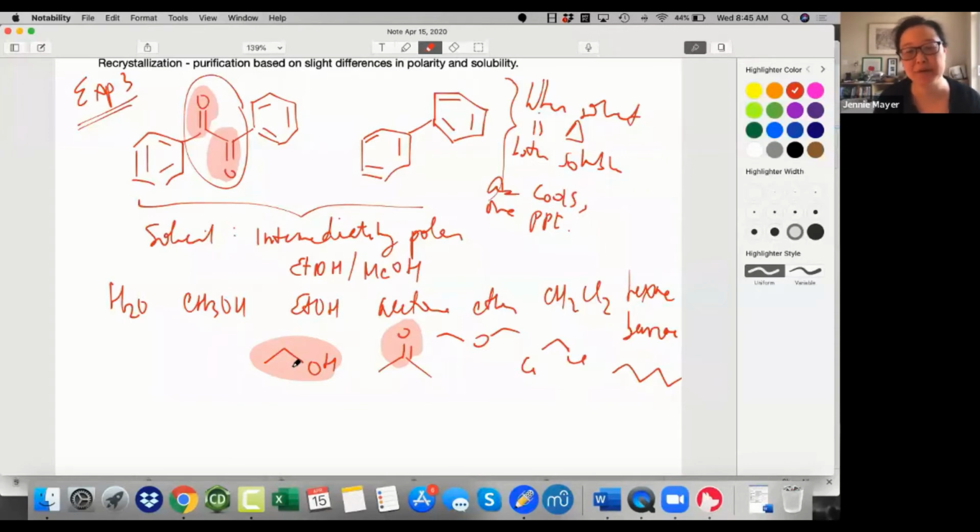In the Merck Index or in the CRC handbook, you can look up whether it's soluble or not. But before I show you that, you can see you want to match some parts of that, but you also want it to be somewhat nonpolar for these guys. So that's also important, to make sure that you are accounting for the nonpolar parts as well.